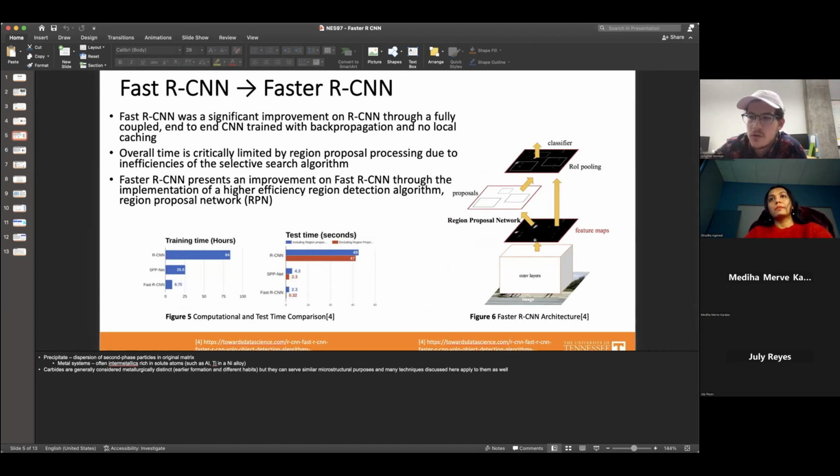So you have the convolutional layer where it's transformed into a feature map, and then you can see that your feature map just passes straight to the region of interest pooling, but at the same time you're having your RPN generate your region proposal maps, and that's what's isolating features in the feature map, and from there it goes to the final classifier. Right. And this is ROI pooling, and in ROI pooling, they are trying to, again, condense all the features further. Exactly, yeah.